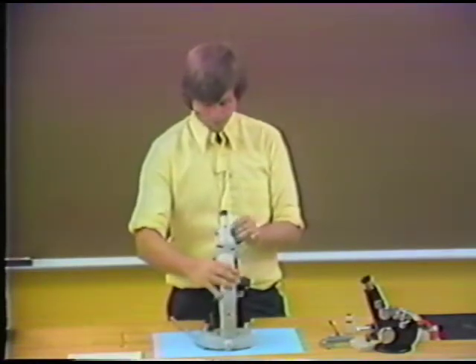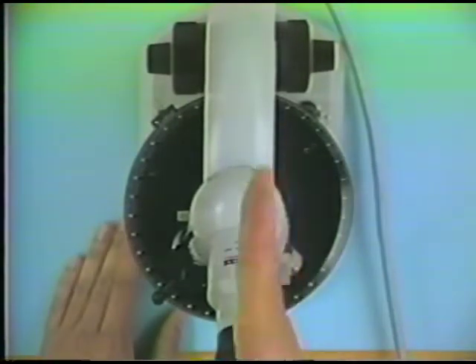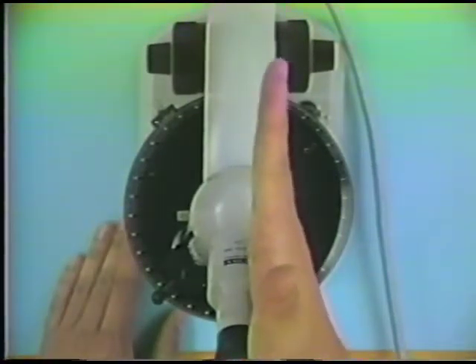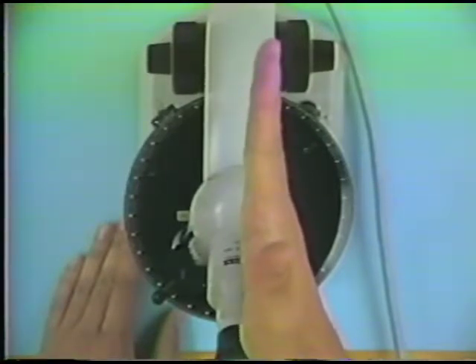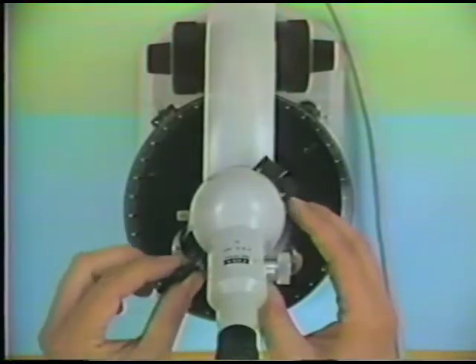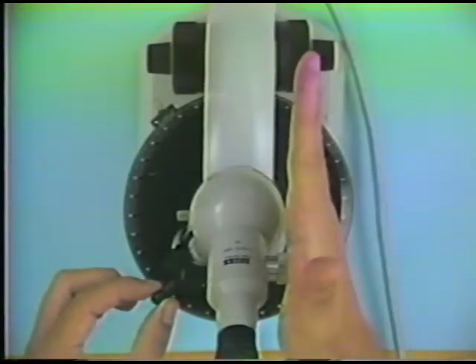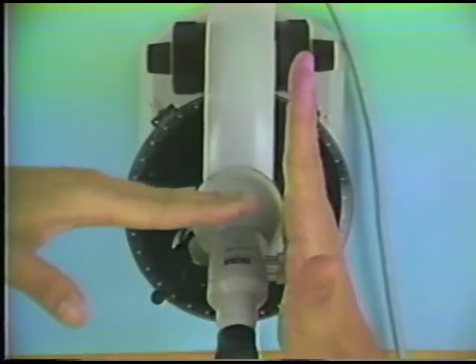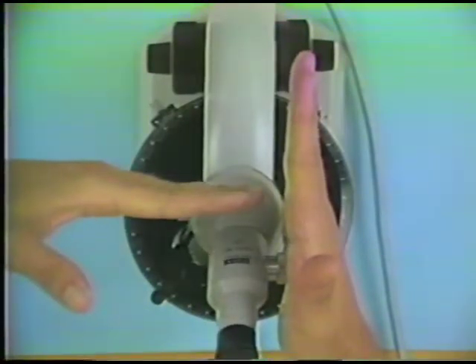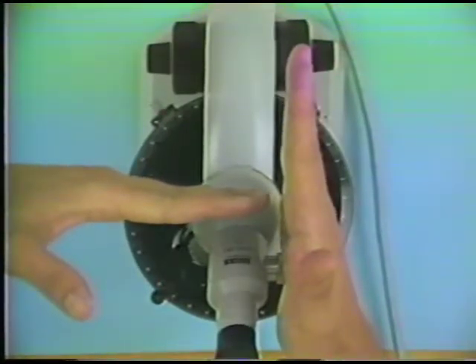Now, the upper polarizer, or the analyzer, by convention in a Zeiss microscope, always has its polarization direction in a north-south direction. Okay? So when we have this upper polarizer in, then we have a polarizing screen above the stage oriented in this direction, a polarizing screen below the stage oriented in this direction. East-west below the stage, north-south above the stage. This is a convention adopted by Zeiss microscopes.